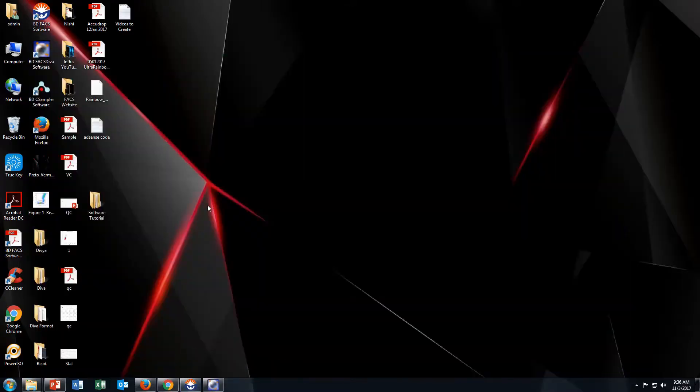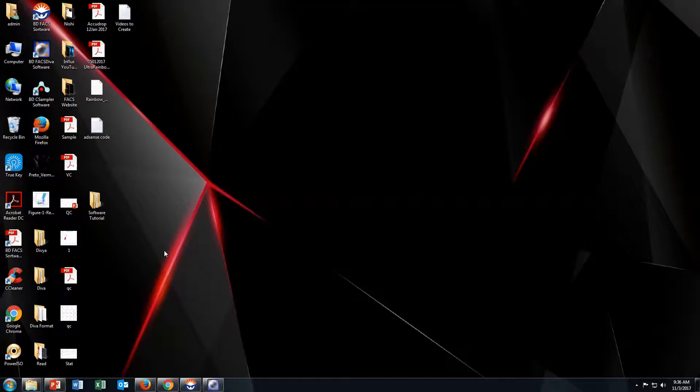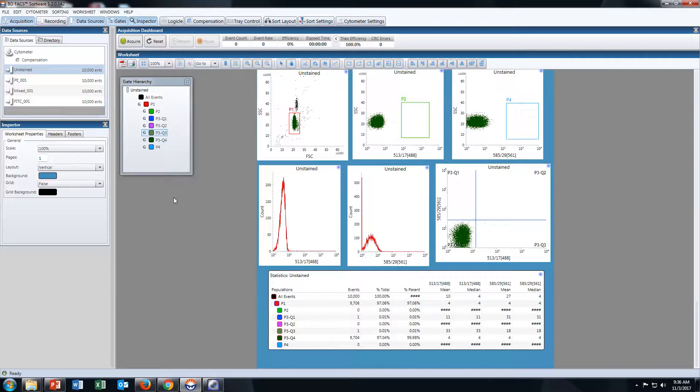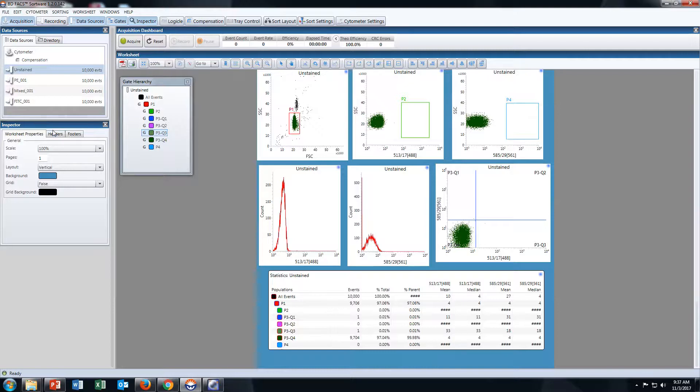In this video I will show you how to analyze your BD Influx data in BD FACS DIVA software. Open your workspace in BD FACS Sort software for BD Influx sorter. This is my workspace for a two-color experiment with four tubes: Unstained, PE, Mixed, and FITC.